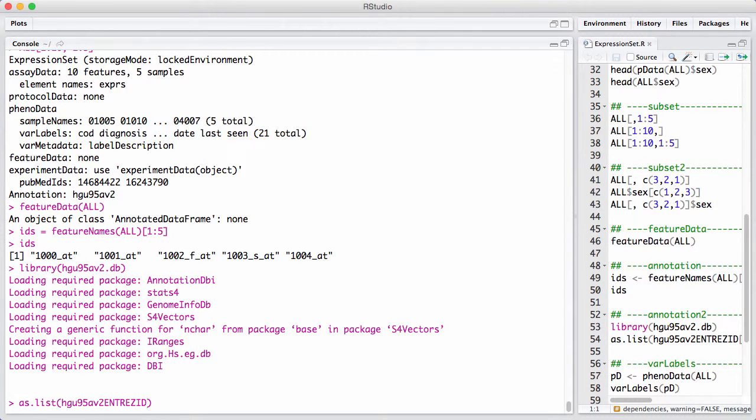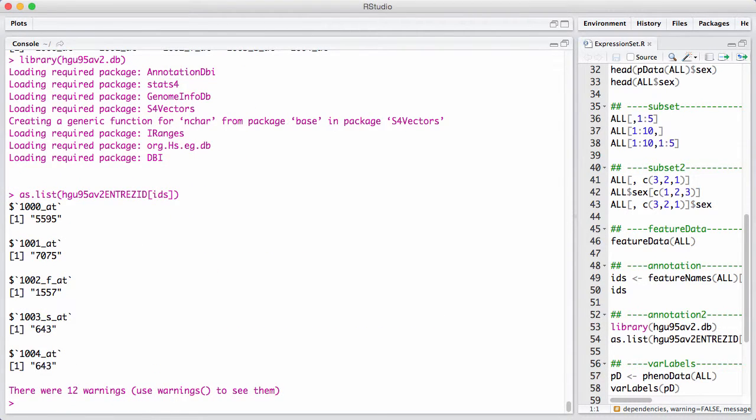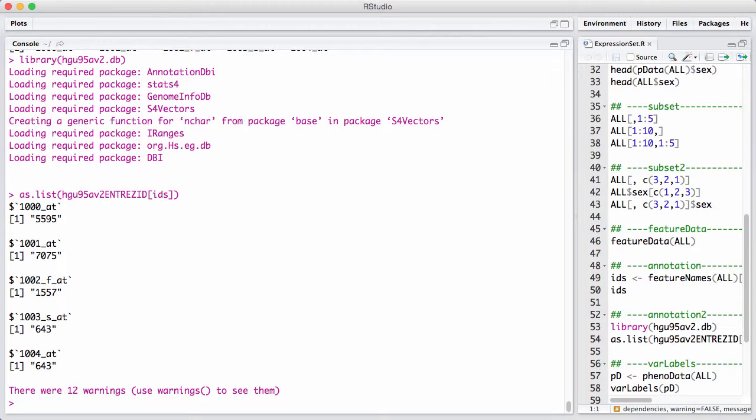So, we're going to take this stuff here, we're going to subset it like this, and you can see here that we now get something back called Entrez IDs that we can query. These are meaningful gene identifiers. We can query them in a public database.